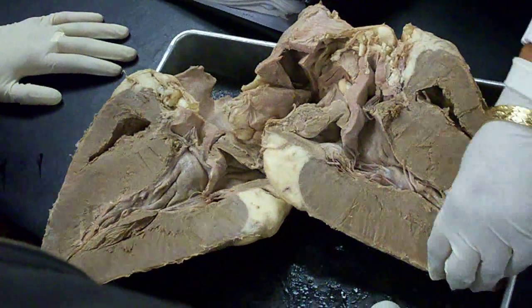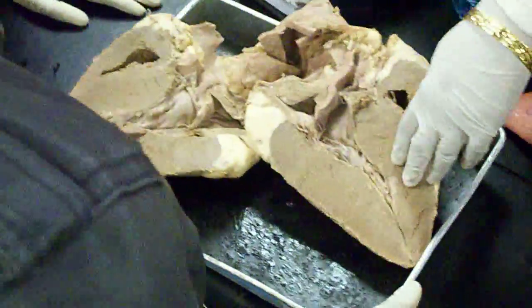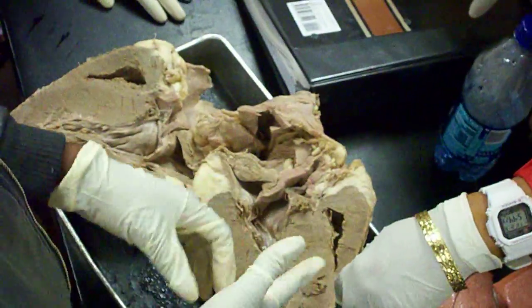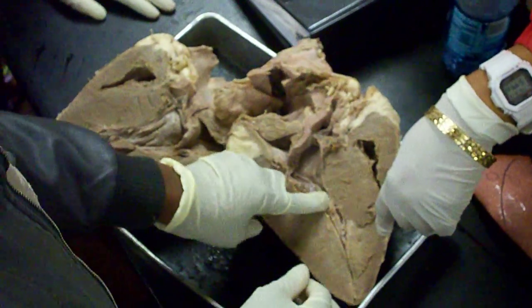So do we consider this trabeculae carneae or would you consider this the myocardium? Well, the muscle is myocardium, but it's actually a trabeculae carneae. I thought this was the trabeculae carneae. I thought that was the papillary muscle. This is the papillary muscle. And here? This is the myocardium.